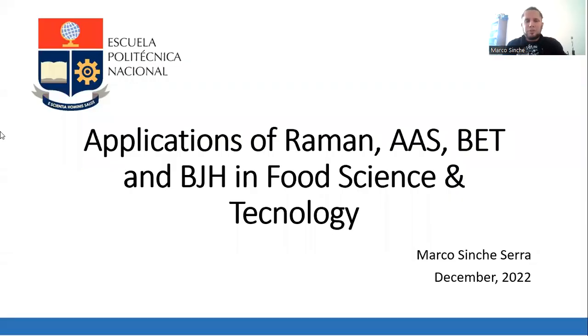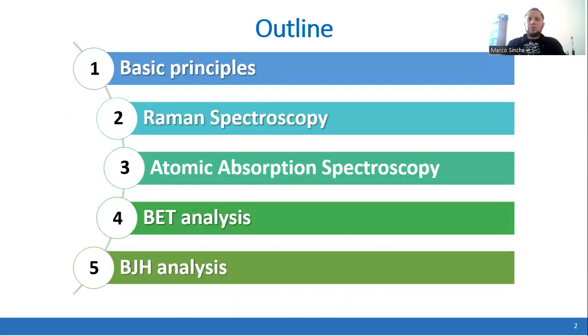In this presentation, I will talk about 4 techniques that are used to characterize material and their applications in food science and technology. This presentation will contain a brief introduction regarding the basic principles of these 4 techniques, and then I will explain in more detail each of these 2 spectroscopic techniques and the other analyses that are based on the adsorption process.